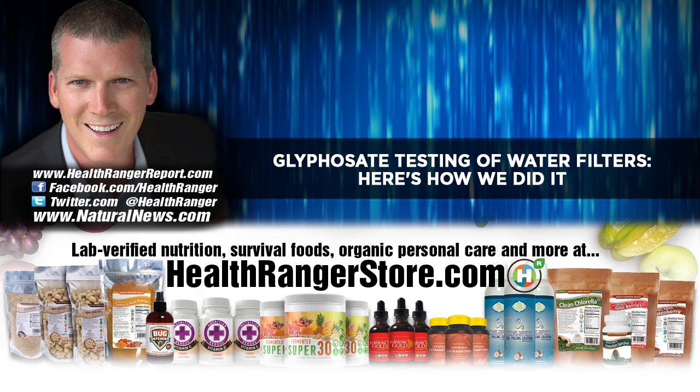It uses a lot of toxic chemicals that are very, very harsh, bad for the environment. So I immediately, from day one, I said, we're not going to do that. So when I asked around my scientific colleagues, I said, so what can we do that does not involve post-column derivatization? They kind of chuckled and said, well, there's not that much out there, but there are some new columns that people are playing with, and there's some chemistry people are playing with, and so on. So they recommended some papers, they recommended some columns to try.